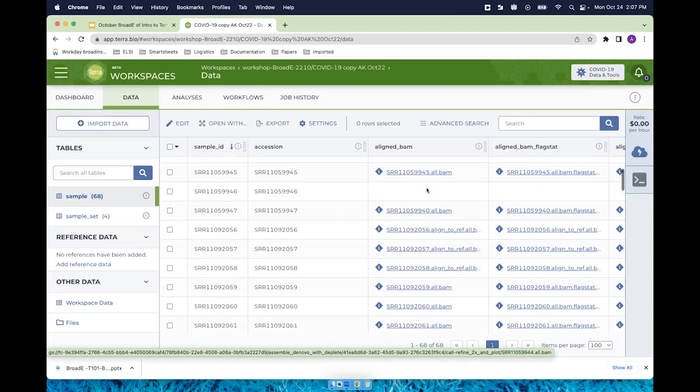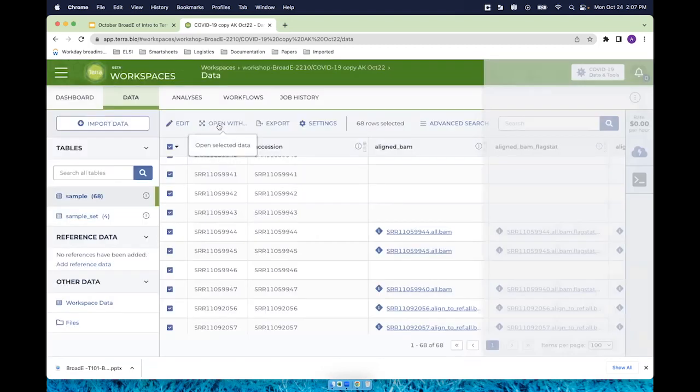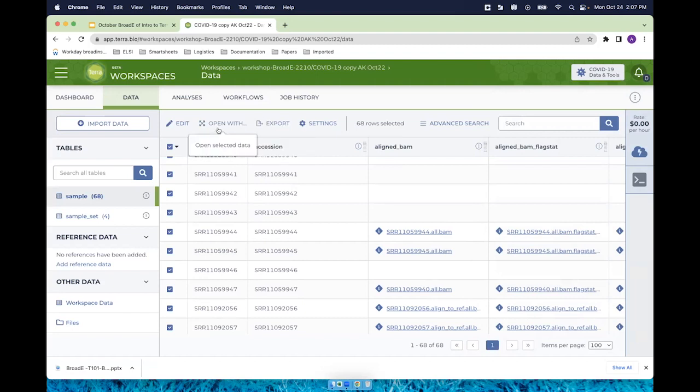we see that it looks like a spreadsheet. And indeed, I'll show you how to download this as a TSV later on. We can export this, download this as a TSV, and we'll take a look at doing that in just a moment.